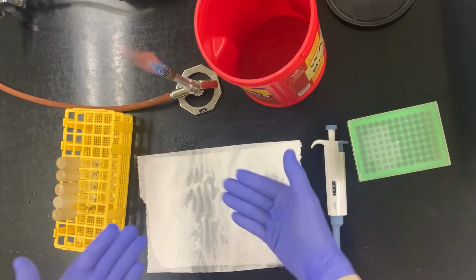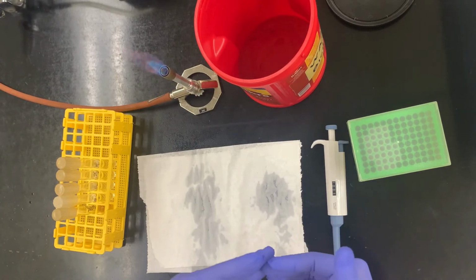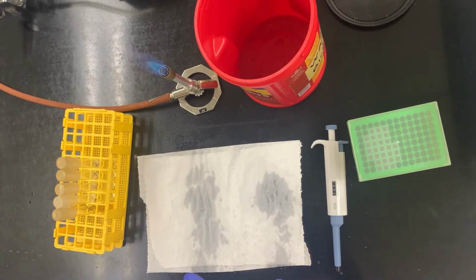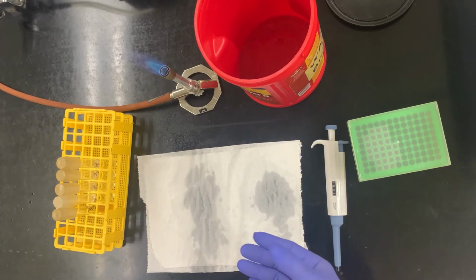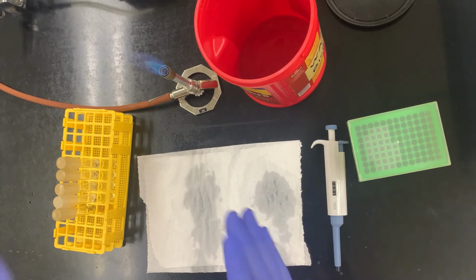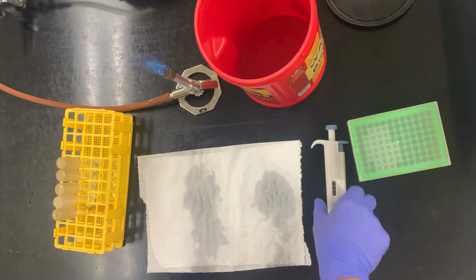Whenever I make any little drops, even though this pipette is going to be very accurate and minimize the amount of spillage, there's still going to be some. So if you spill everything in this area, then generally it's much easier to clean up. And always notice it's near our flame, because we want to be by the flame. So let's do this then.